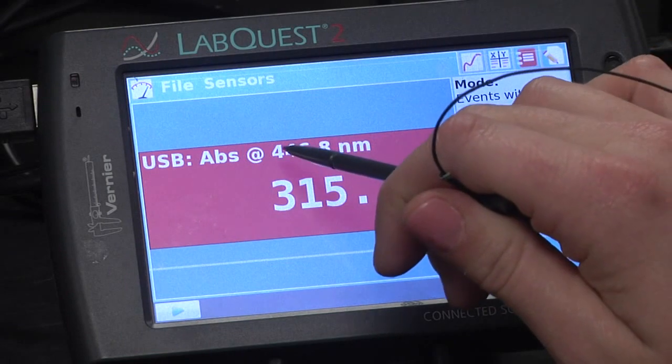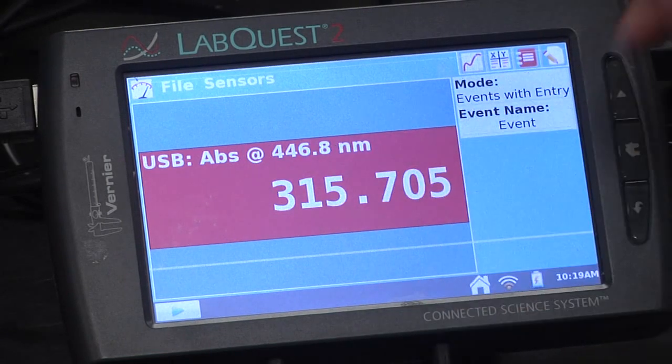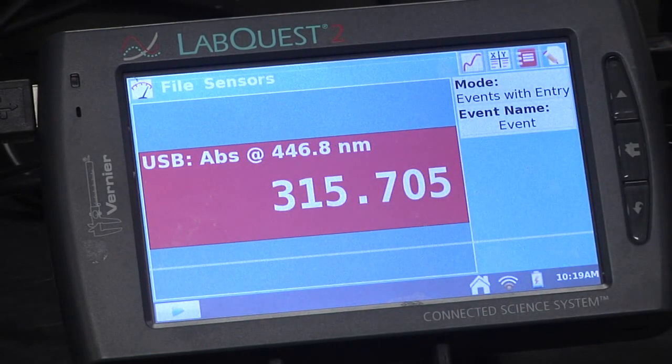You see how it automatically corrected it to 446.8 nanometers? Don't worry about it, it's close enough. Next you're going to want to calibrate.